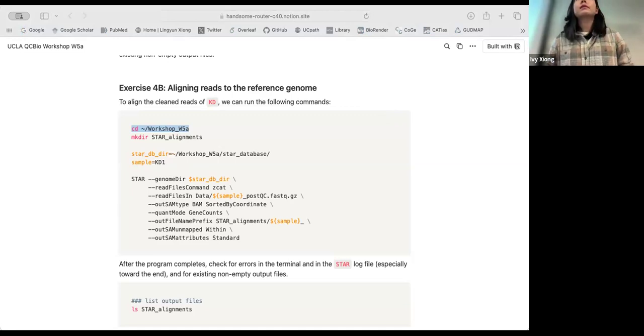That's a fatal error. You want to go back one level.